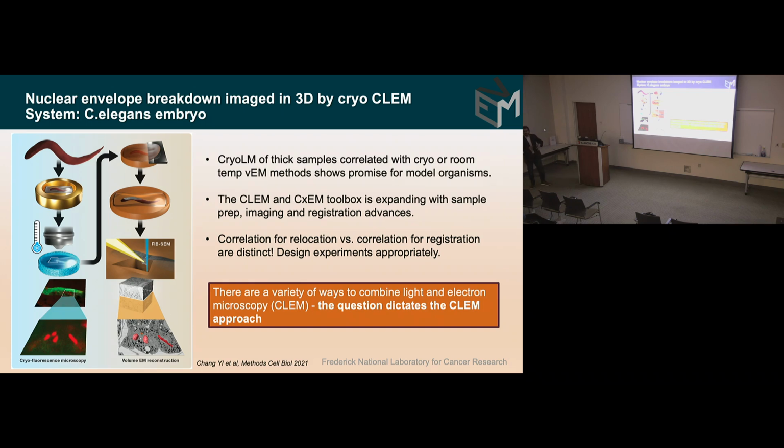Which is statistically probably just as valid, because we knew it was the same, since we had the fluorescence live cell imaging of exactly the same spermatocyst. So we knew that all 16 cells were completely in sync. I showed you that movie, right? They all are in sync. So one of them was for volume EM and the other one was for TEM, because at the end of the day, the gold standard for resolution is TEM, and that's how we do it.